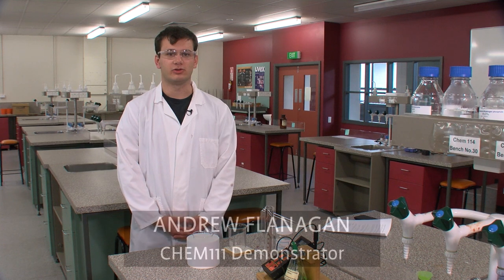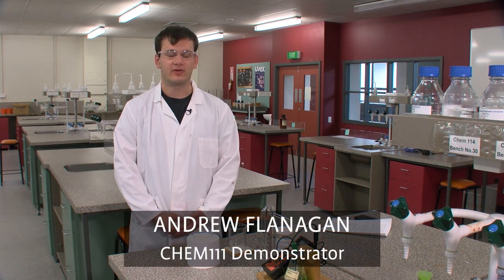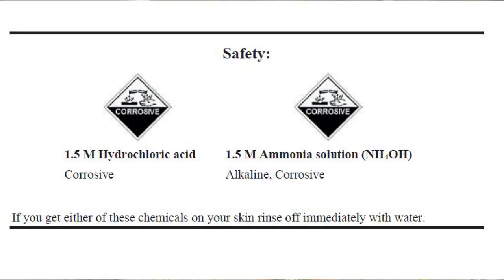Kia ora, I'm Andrew. This is the calorimetry lab. This lab will be using solutions of ammonia and hydrochloric acid, which are corrosive. If you get any on your skin, wash it off immediately and then notify a demonstrator.